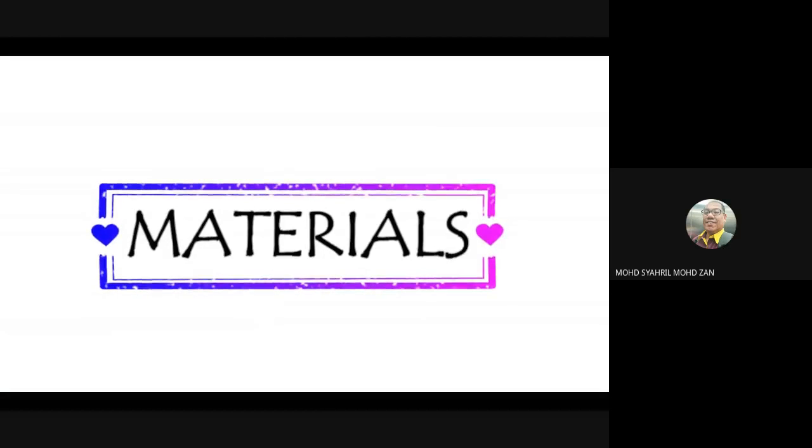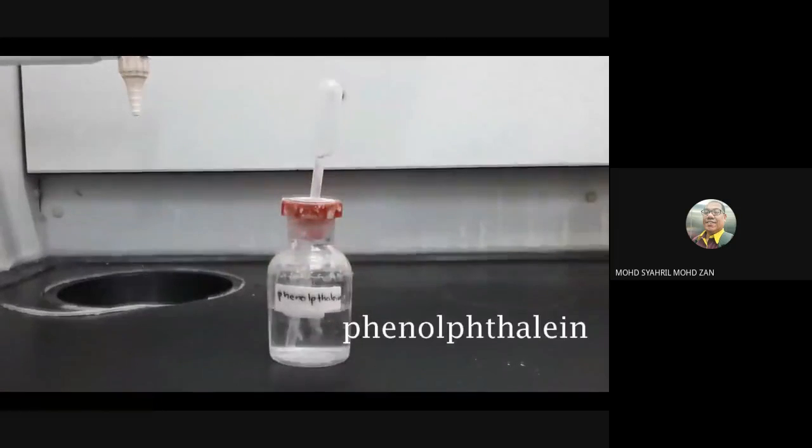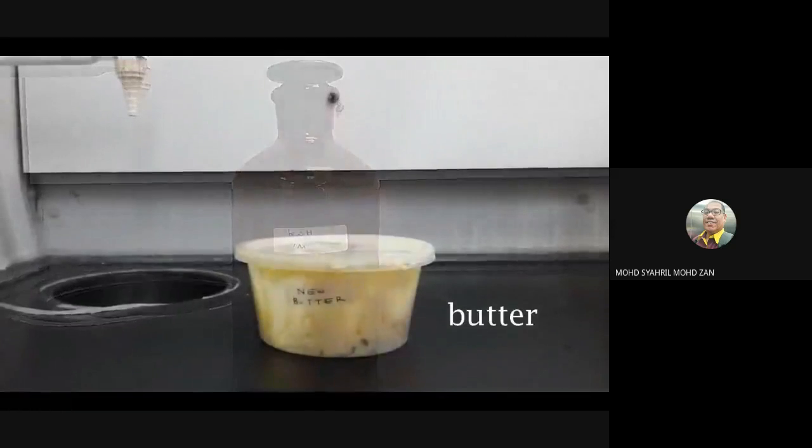Materials that we use are hydrochloric acid, phenolphthalein, alcohol, potassium hydroxide, and butter.